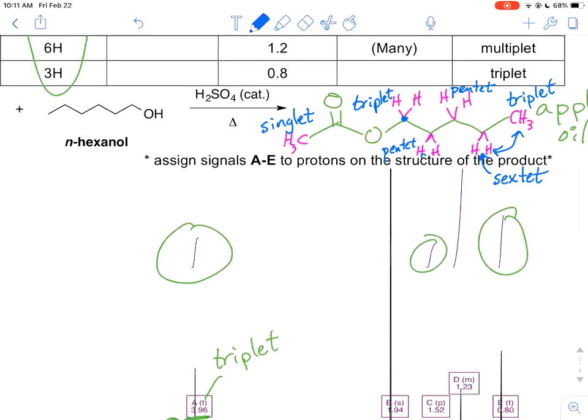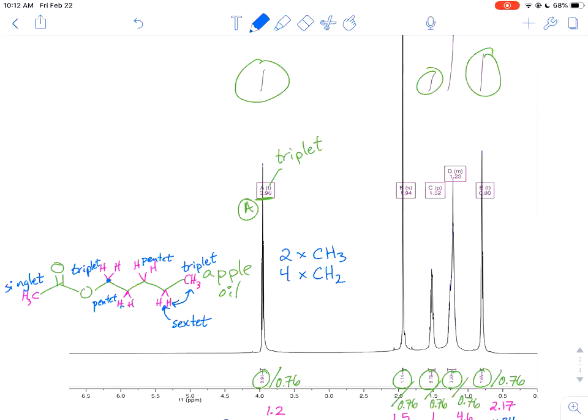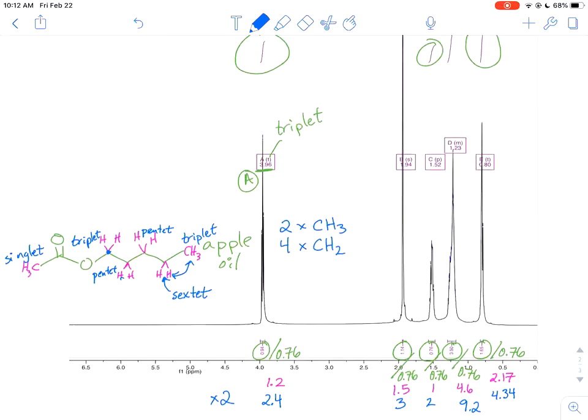So those are the potential splitting patterns that we're looking for. I think what I'm going to do rather than scroll back and forth is just drag that compound down below. So then where are we? We have our whole spectrum there. There's our integration values. So now we're going to take that back to integration. And we can use some splitting to help us sort of figure that out.